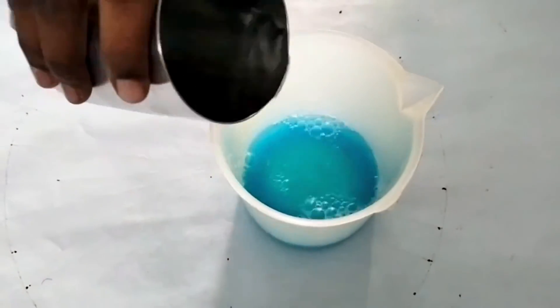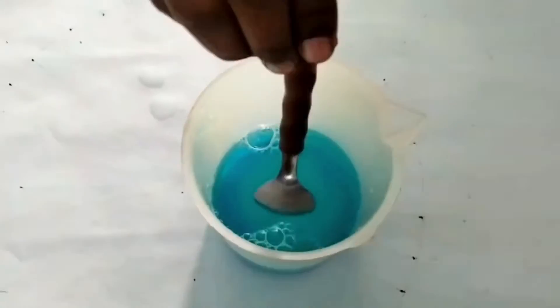Dissolve crystals of copper sulphate in pure water to prepare a concentrated solution.